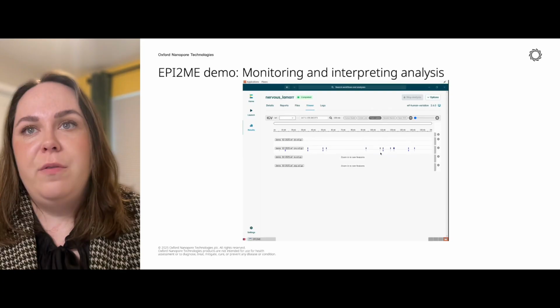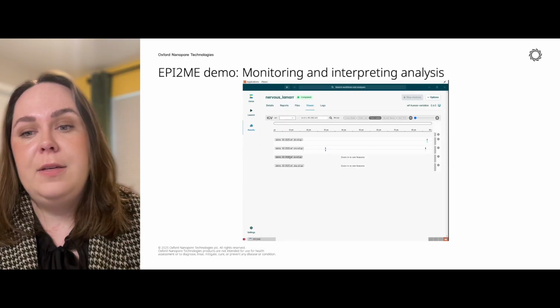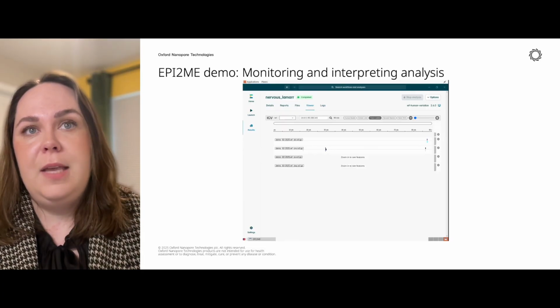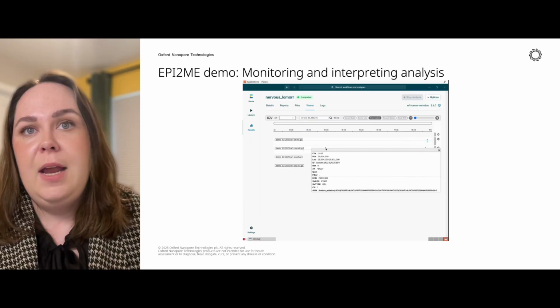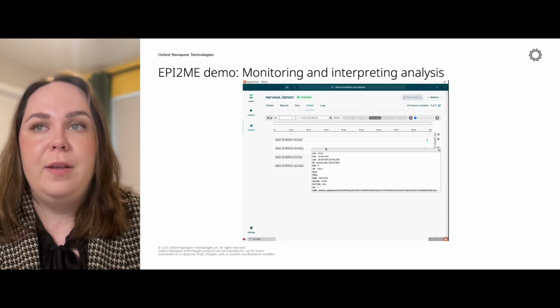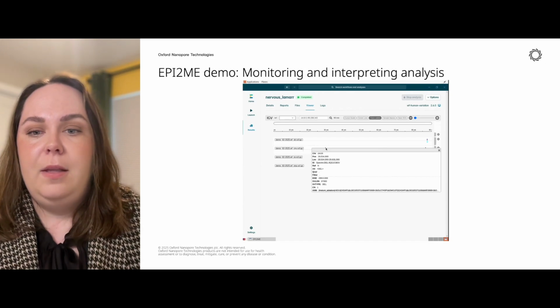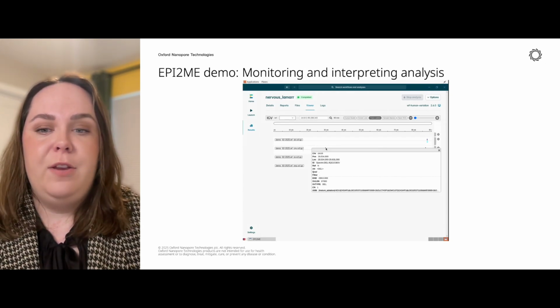You can also mouse over these variants and get specific important variant statistics. In this case, I'm going to look at a CNV that's called on chromosome 16. You can see the type and the quality filtering that are output directly by the variant caller. These pop-up windows are very important to look at variants of interest.